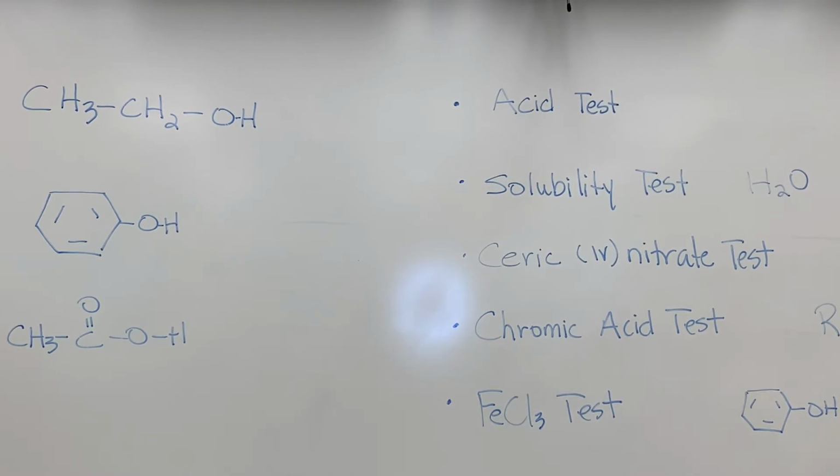If we have a known acid, and the thing about those indicators is that they contain, I think it's potassium hydroxide, and if you have something that is a strong enough acid, it can react with that potassium hydroxide and change the pH of that solution. And indicators change their color when the pH of the solution changes. So visually, that's how we'd be able to see a difference.